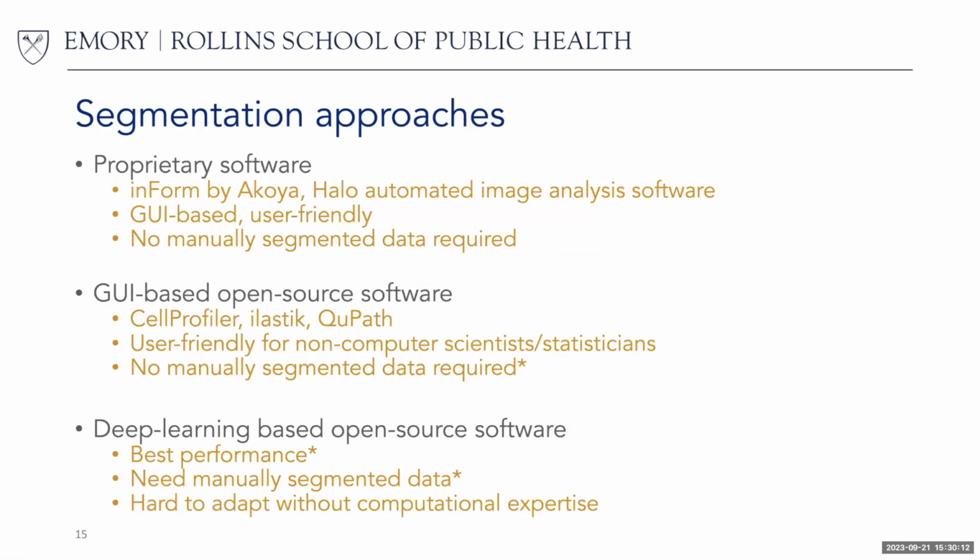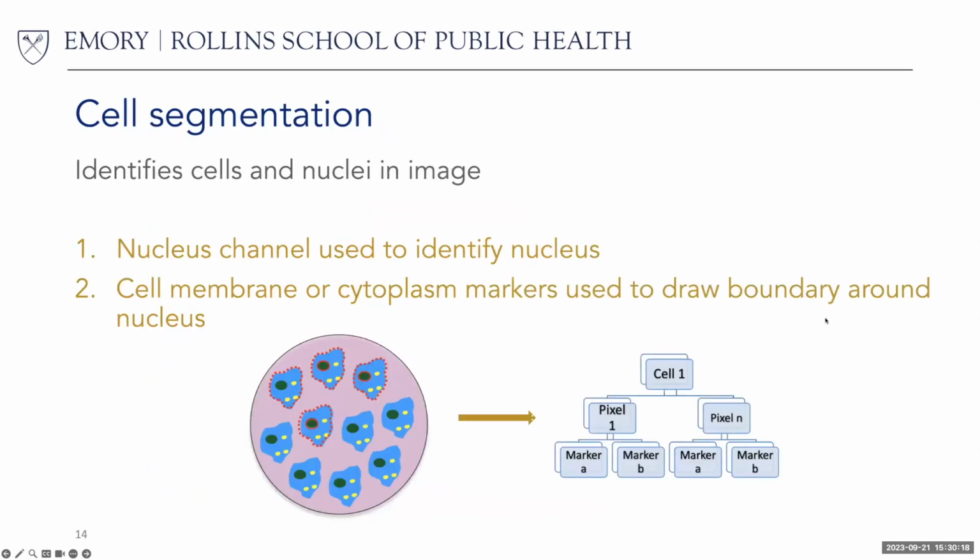Jumping in with a question real quick. Sure. Are there separate markers for the nuclear membrane and the cell membrane? So the nucleus itself, it's not the membrane actually. It's just the whole nucleus. Usually DAPI is the marker used for that. And then yeah, you have a separate marker for the cytoplasm or the cell membrane. Okay. Thank you. Yeah, good question.